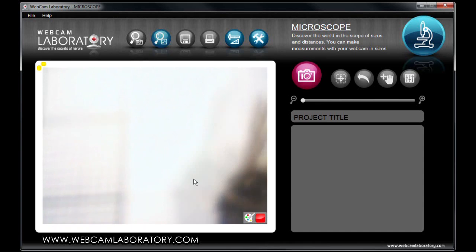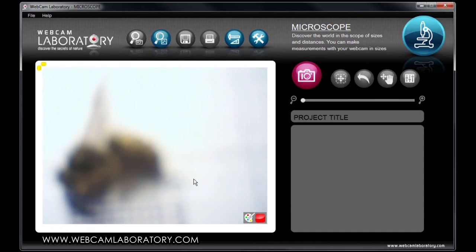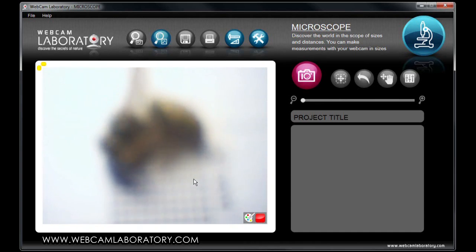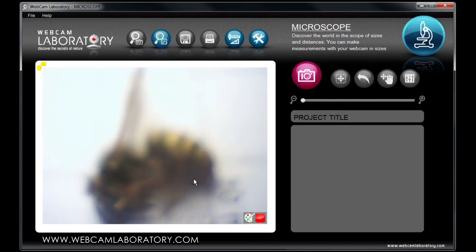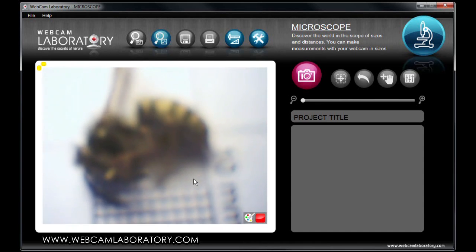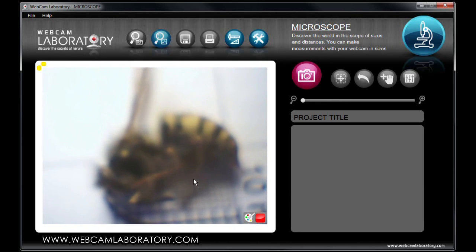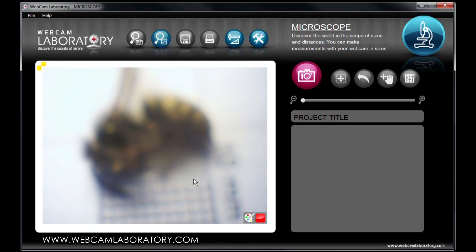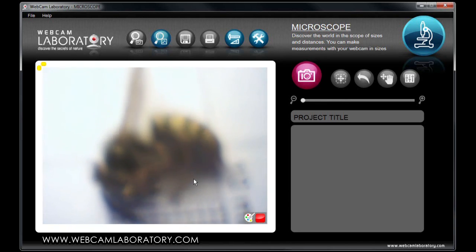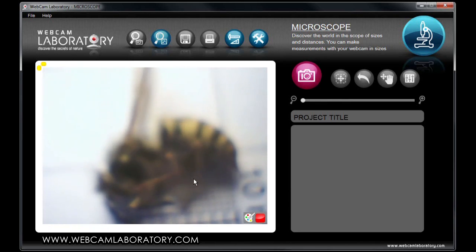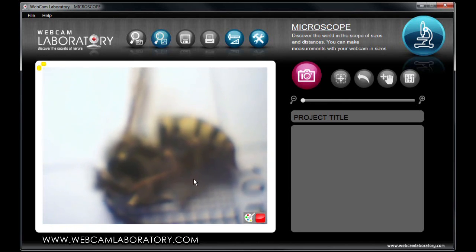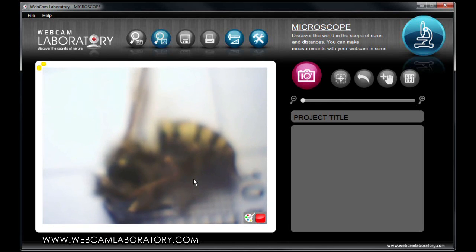This time, we will observe a wasp. The Webcam Laboratory team would like to ask you to only examine animals that have died in the natural way. Please do not kill any animals for the sake of an experiment.